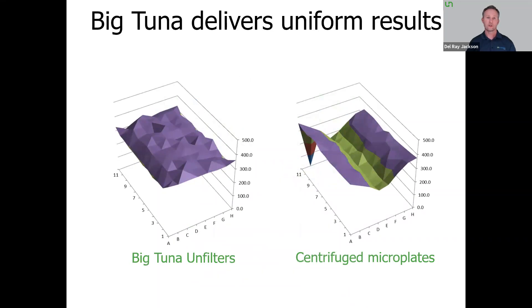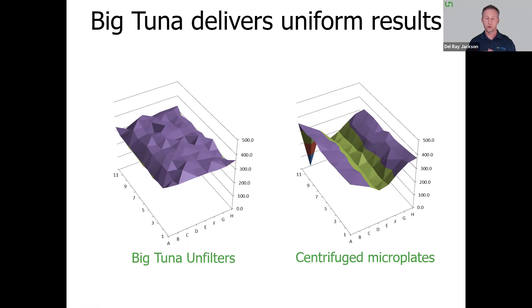The results speak for themselves. What you see here is the amount of recovery across various wells on the left in a BigTuna Unfilter compared on the right to a centrifuge filter plate. All that purple on the BigTuna Unfilter shows that because of individual volume measuring, uniform pressure, and gentle mixing, we get uniform recovery across all of the wells — as opposed to centrifuging a filter plate, where you typically get uneven force in the middle of the plate that processes samples at a faster rate, giving you inconsistent results. Not so with BigTuna.